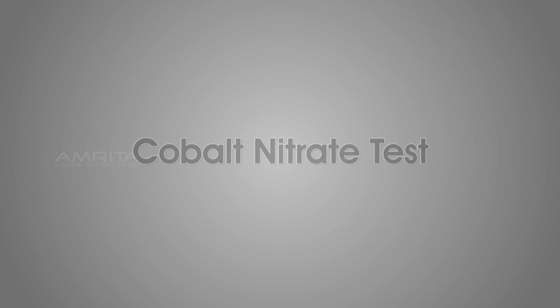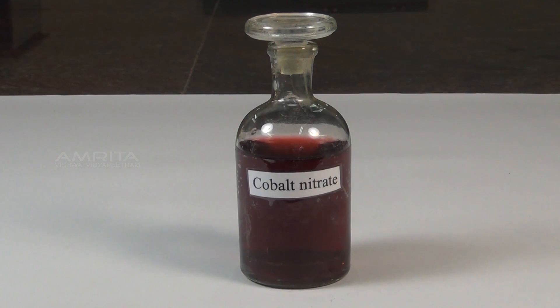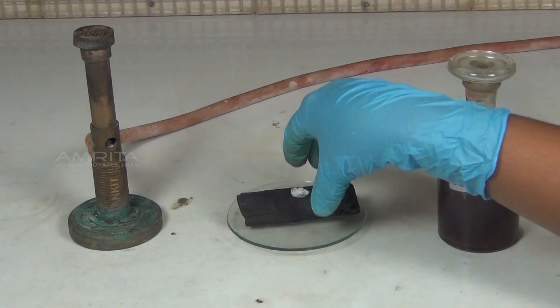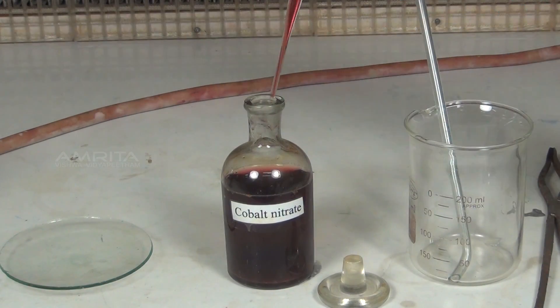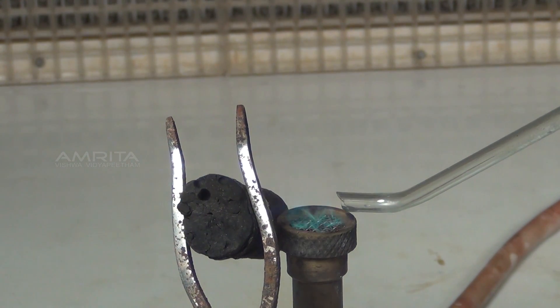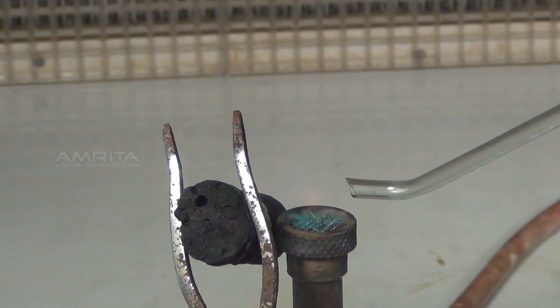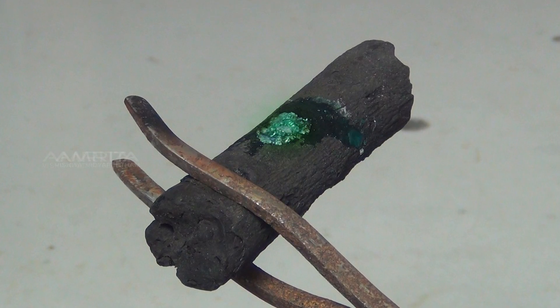Cobalt nitrate test. Materials required: white residue obtained in the charcoal cavity test, cobalt nitrate solution, dropper, tongs, blow pipe, and Bunsen burner. Procedure: Take the charcoal piece with white residue in it. Using a dropper, add a few drops of cobalt nitrate solution to the white residue. Using the tongs, hold the charcoal piece in front of the oxidizing flame of the Bunsen burner. Direct the oxidizing flame on the cavity by means of the blow pipe and heat strongly for some time. Formation of green residue indicates the presence of zinc ion.